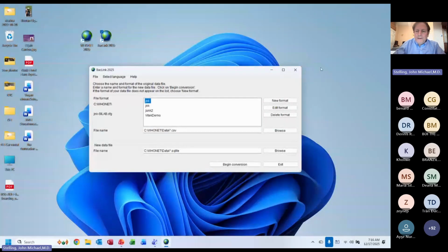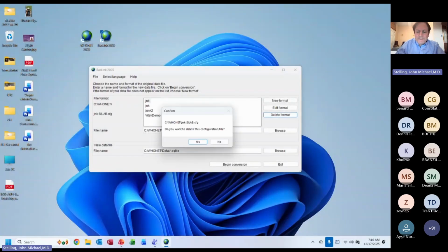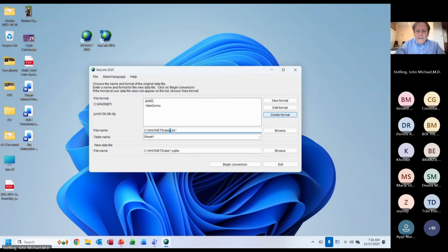And then I'll just do some delete. I was just doing some testing. Delete, delete, delete. So when you start BacLink the first time, this is what you see.